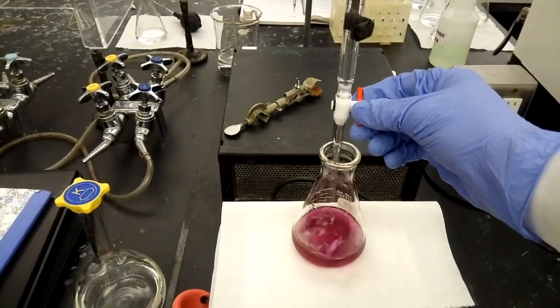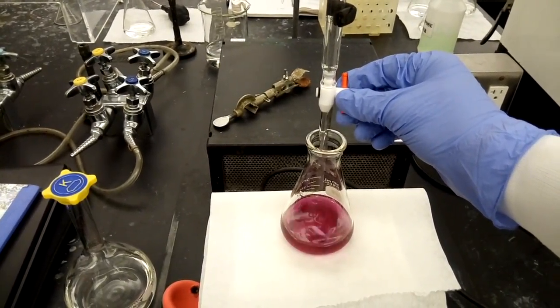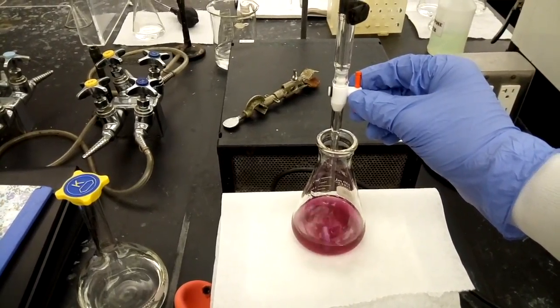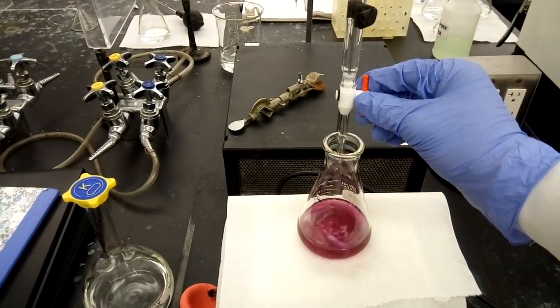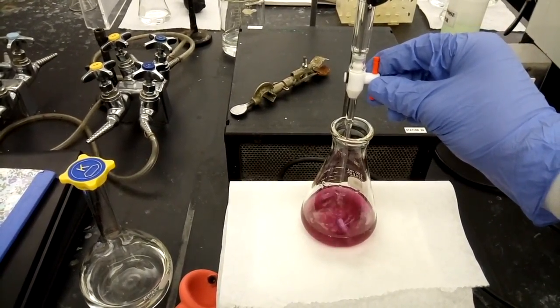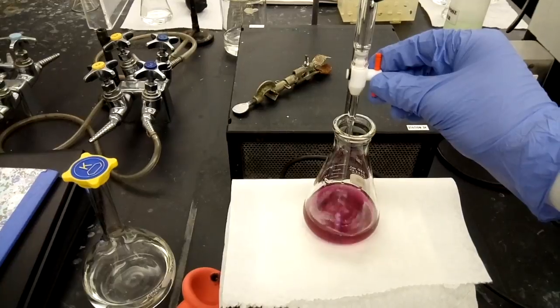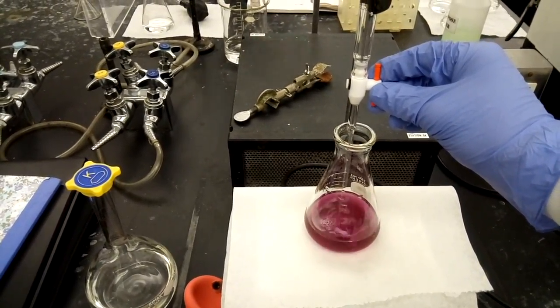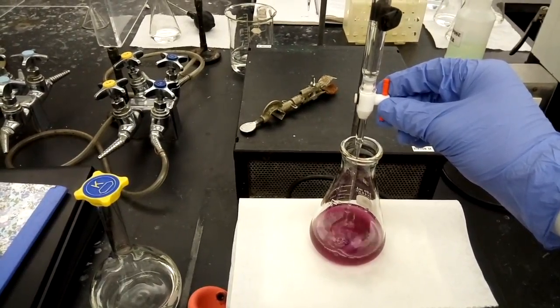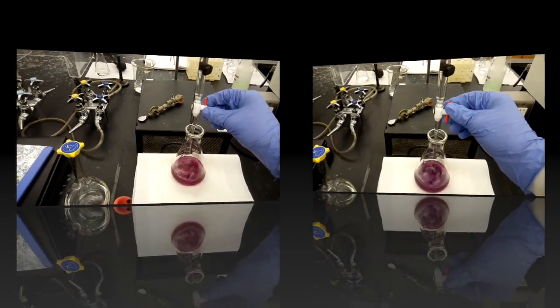We will start by adding large amounts at the beginning of the titration and can slowly go to smaller amounts at the end of the titration. This will allow us to be precise in determining the endpoint and equivalence point as when the color changes, because the color does change rapidly with an indicator. As we are doing this, we will want to pay close attention to the colors that are presented as more and more of the titrant is added to the analyte.